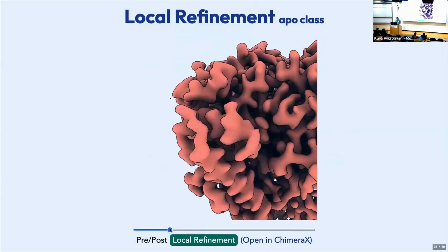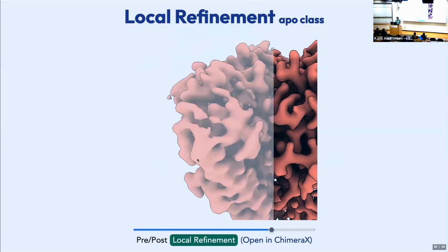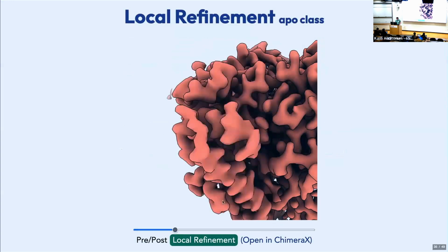If you compare the thumb here, we have this blurring between these domains. There's all this fragmentation and noise here. We can't really see the side chains there. Suddenly, the helical pitch is very obvious, and these larger residues are clear. This loop is visible, and importantly, that FMRFA density is completely gone, right?